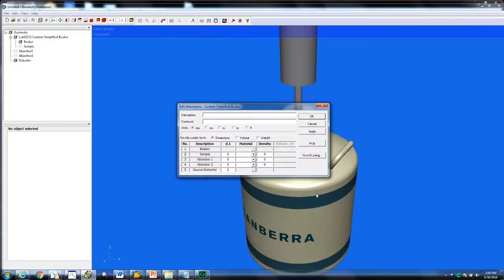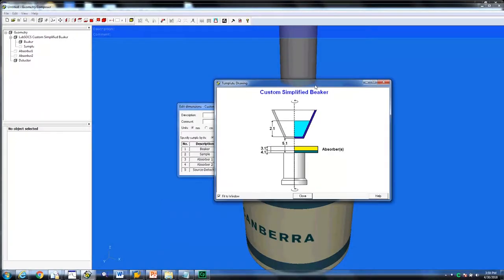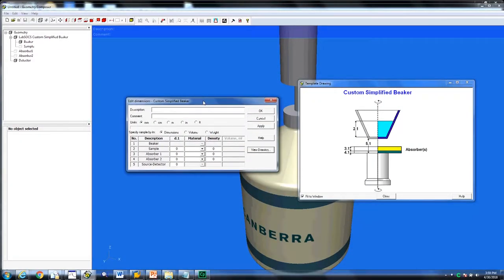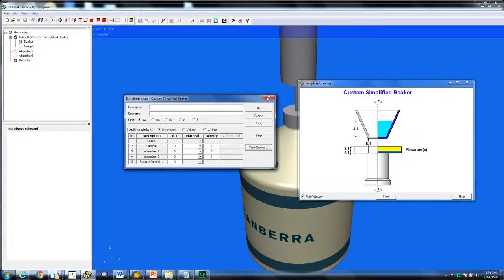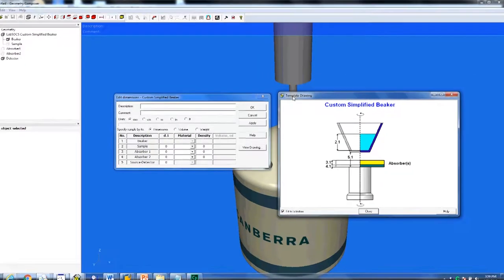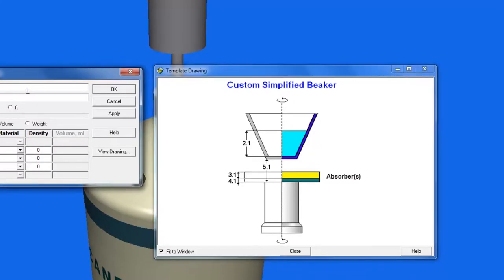Click the View Drawing button. You will be presented with a schematic of the chosen template as well as applying the specific geometry parameters. For example, parameters 2.1 here talk about the sample fill height.